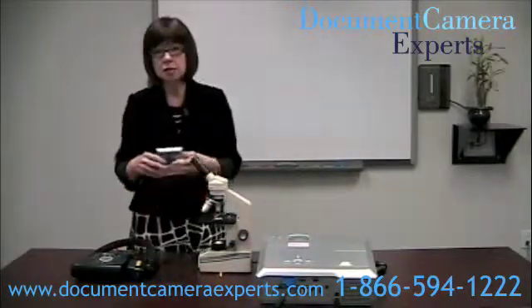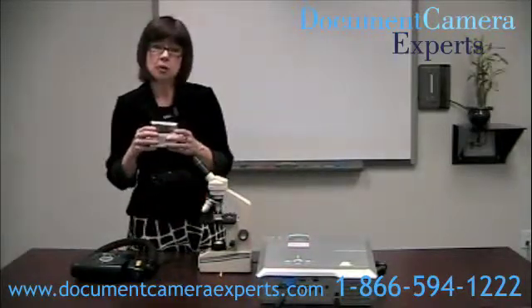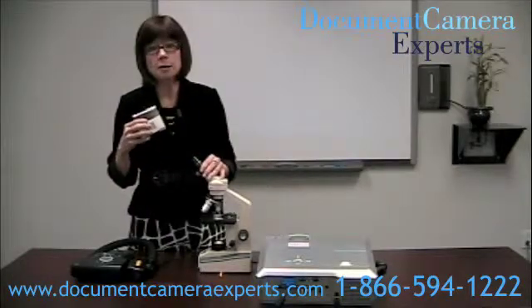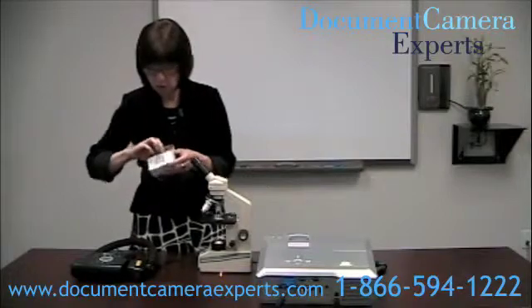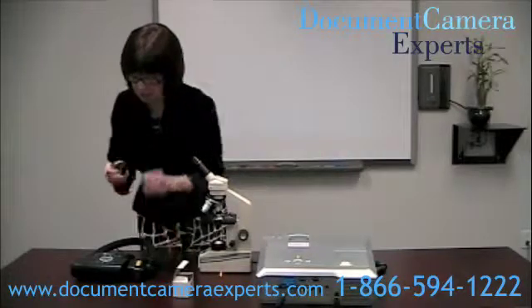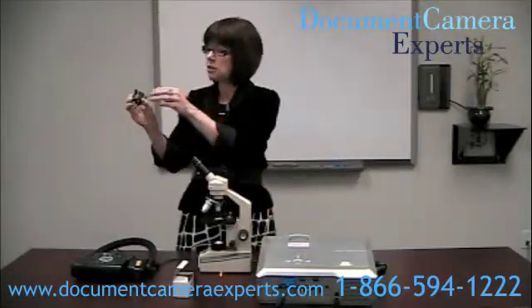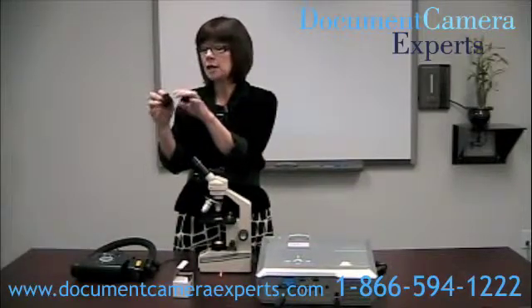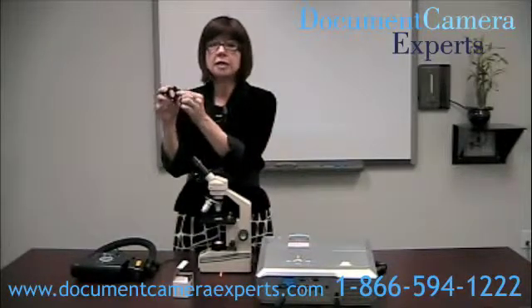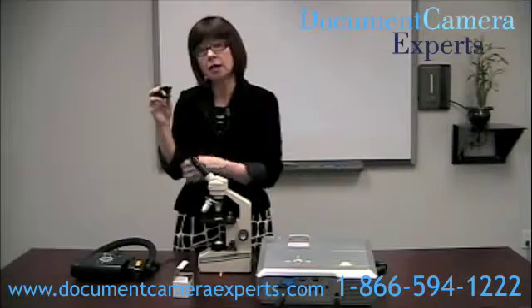We're going to use an adapter, and when you buy these, they come two to a box, and that's to fit the different eyepieces that you have with your microscopes. For this one, we'll use the 28 millimeter, and if you look at it, you'll see that it's got a hollow body — it's plastic. There are three screws, and there's an adapter at the end that will fit exactly on to the CP300 head.